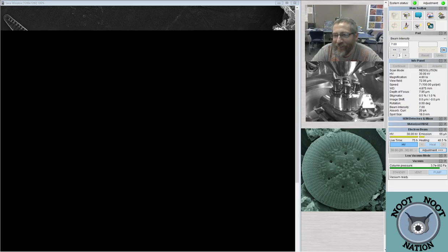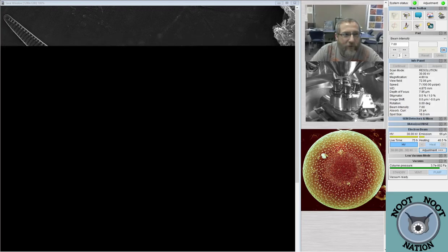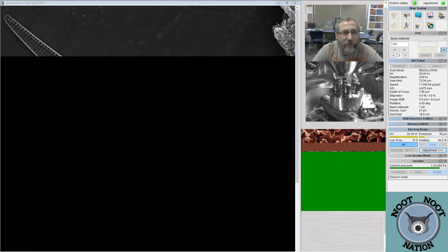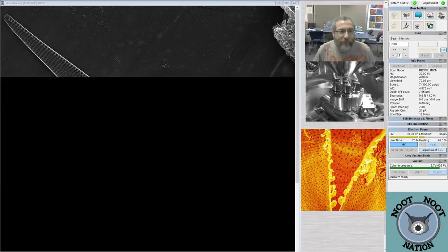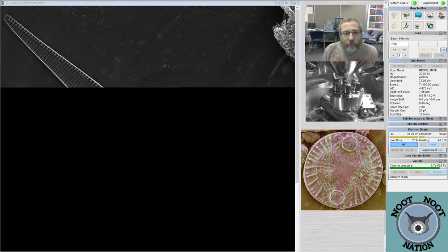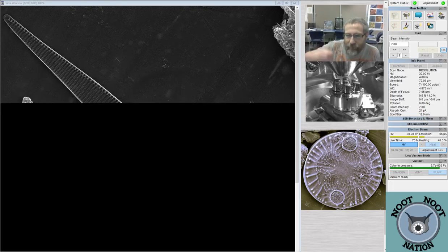Achievement unlocked. Oh, wow. Because that was one of the things. We always skip over the Nitzschia, or the Pseudo-nitzschia. It's nice to have one picture of it. Well, this is nice because it's not in the colony, which I suppose I should have taken one where we actually had the colony. But you can see that colony in the light microscope pretty well. It's a nice internal view, so you can actually see the raphe pretty easily and the fibulae inside.